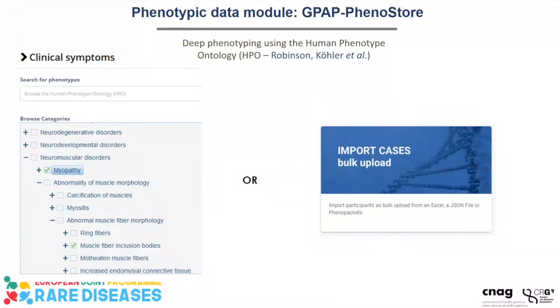The tool itself, I will show you later. You have different steps that enable you to enter the clinical information, to do deep phenotyping, and also to help with differential diagnosis. However, we also enable a bulk import of your data if you already have the information in a standard way in a database or in-house systems. So there are these two possibilities: either you use our user interface or you bulk upload the data through specific templates that we provide.